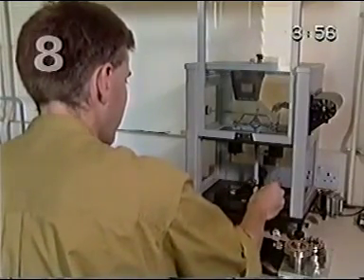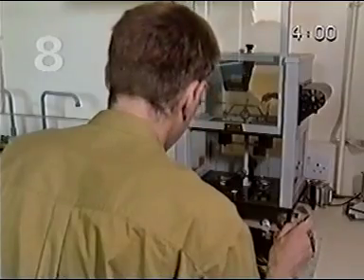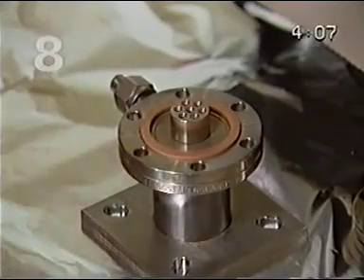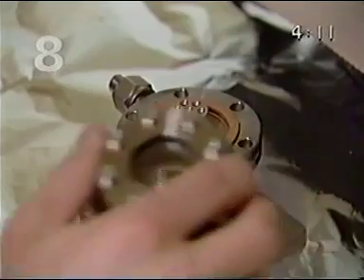The technique is to displace oxygen from the minerals using very reactive fluorine gas at high temperatures. The procedure is to load small amounts, about 1 milligram or less, of selected materials into a carousel for investigation.